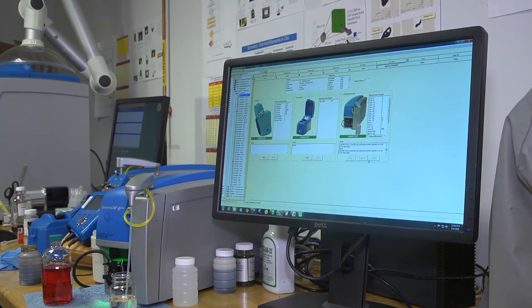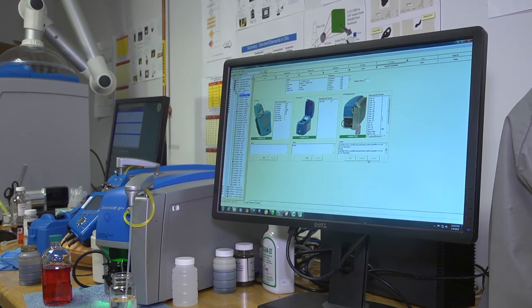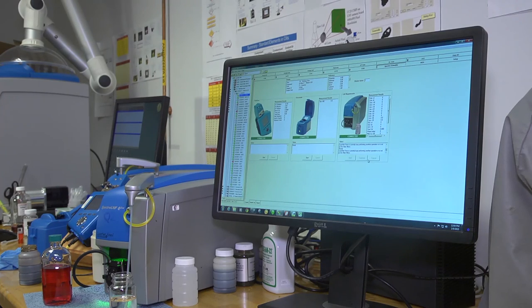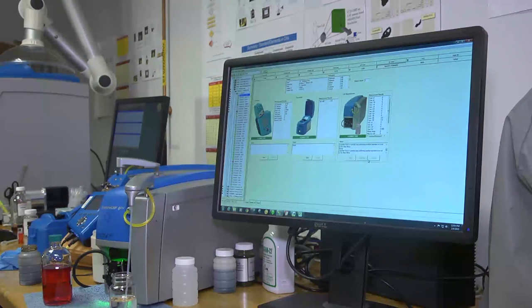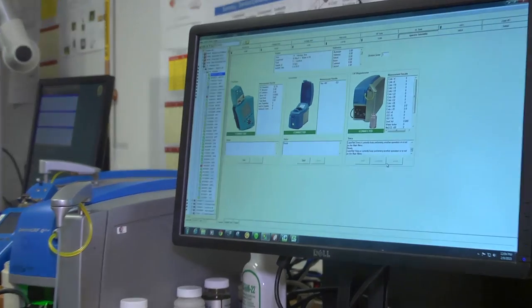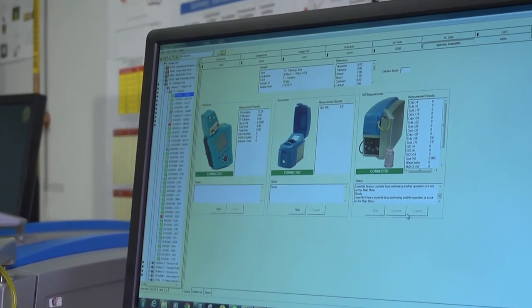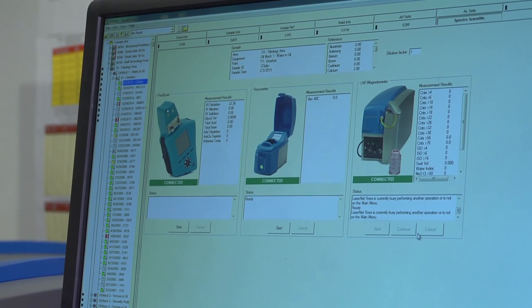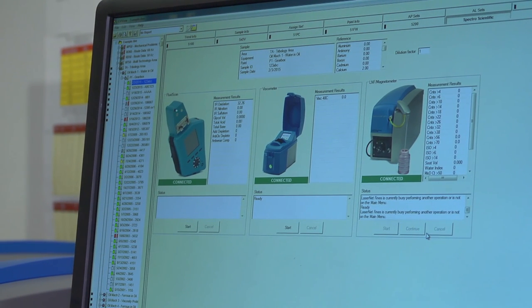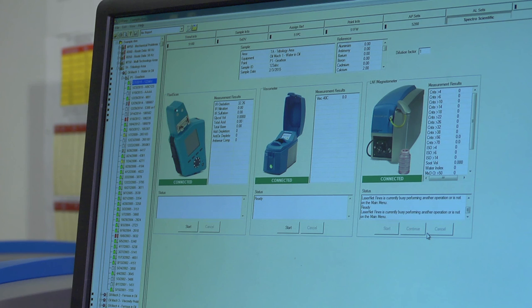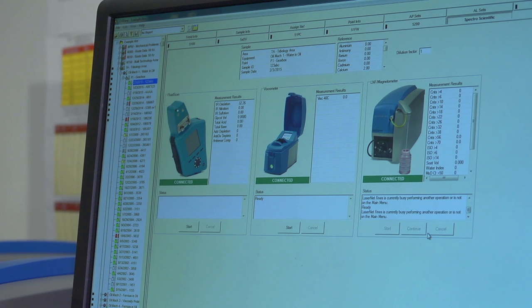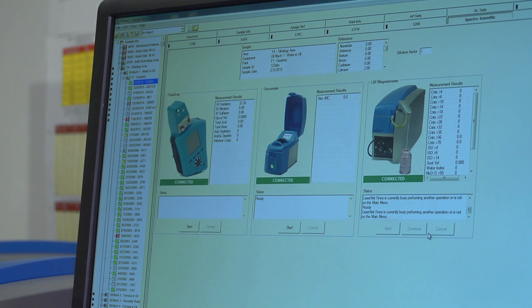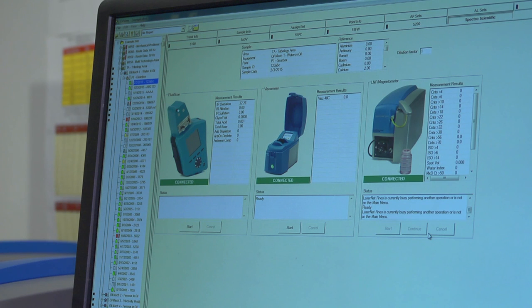We'd like to demonstrate one other capability of the instrument. This is the splash screen from the new Spectro Scientific tab, which is part of Emerson's machinery health management software, AMS version 5.61. It enables you to control the actual operation of the Spectro LNF instrument, as well as the operation of the Q3050 viscometer and the operation of the Q1100 fluid scan.